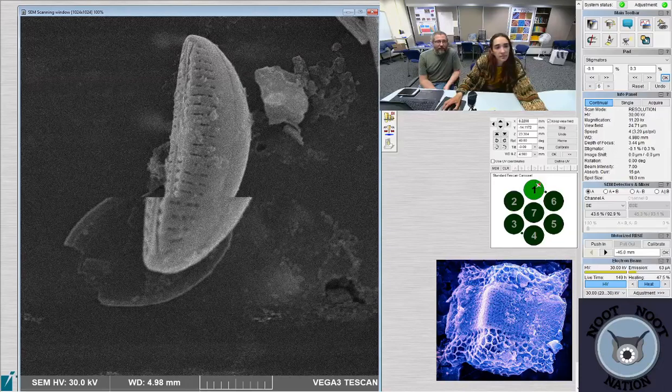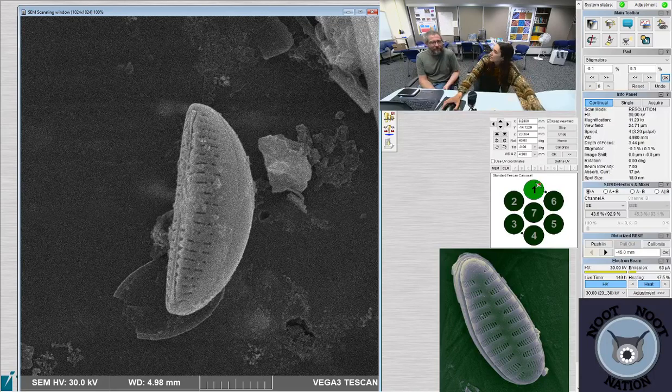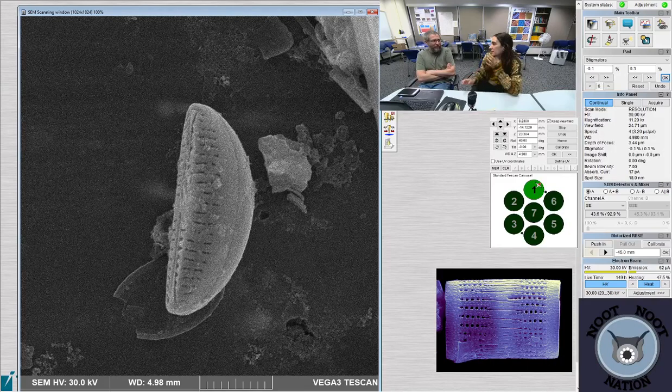And I think visible, yes, but not exciting. I don't think every type of virus you could see. No, a lot of them are smaller ones that have a lipid coating, so they would just look like a blob, and most of them probably would not be very interesting. A lot of times the amphora.